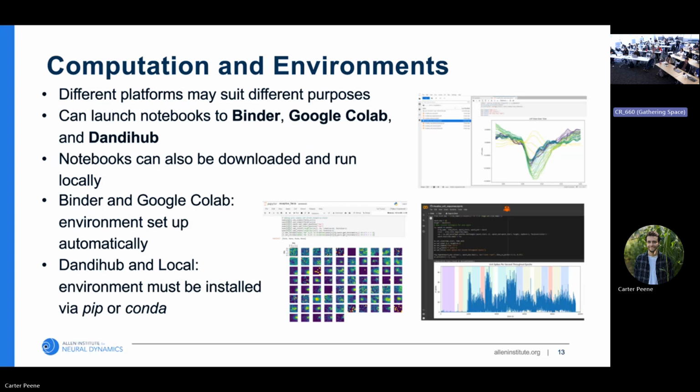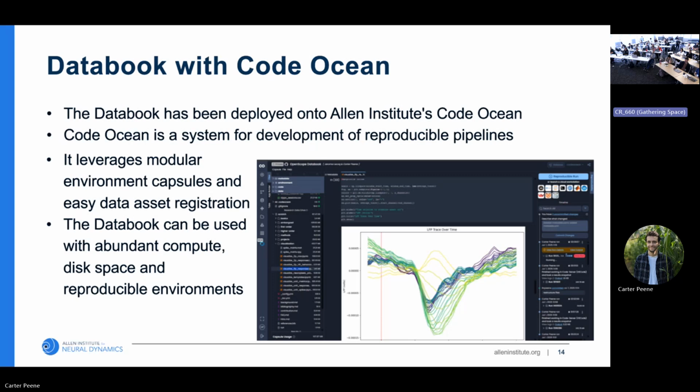And then you might have heard a little bit already about Code Ocean. We've integrated a lot of the institute's processing and packaging into Code Ocean. So we did that with the Databook as well. And it works well. And soon this will be publicly available for other people as well to use. It also has modular capsules and things like that. So I'll demonstrate this in a little bit.